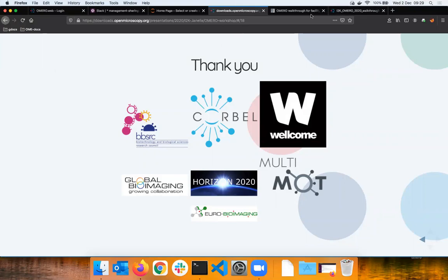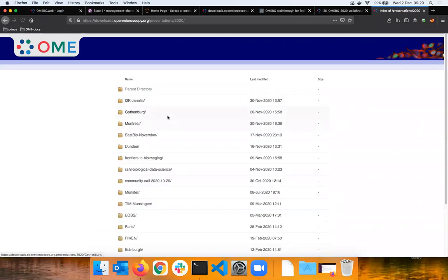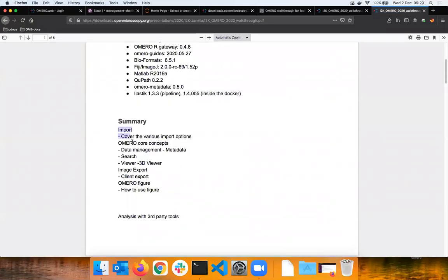We will cover in the first 1 hour and 15 minutes topics which are highlighted in the first part of your walkthrough. Let me navigate again to the walkthrough, which you are hopefully also studying in front of yourself. This is here, and the topics we will do in the first part are covering something like this: import and the OMERO core concepts.